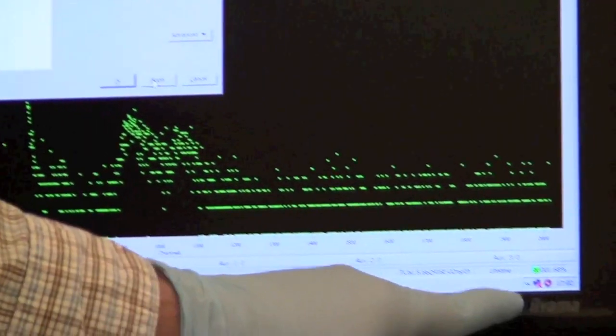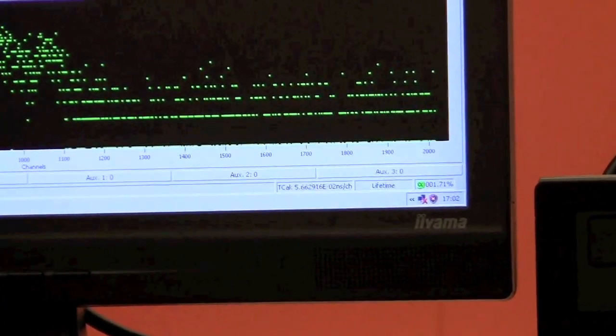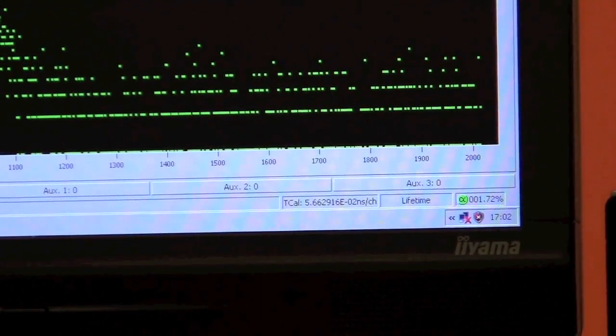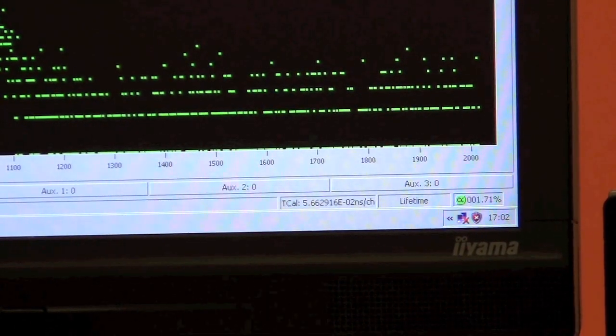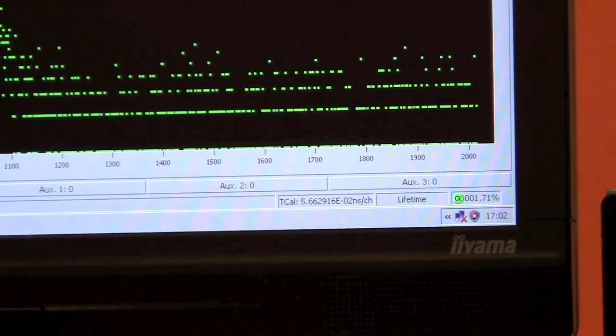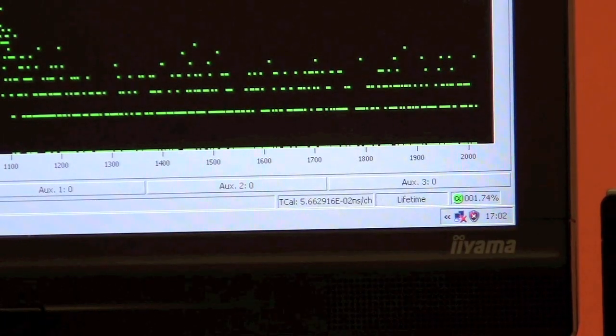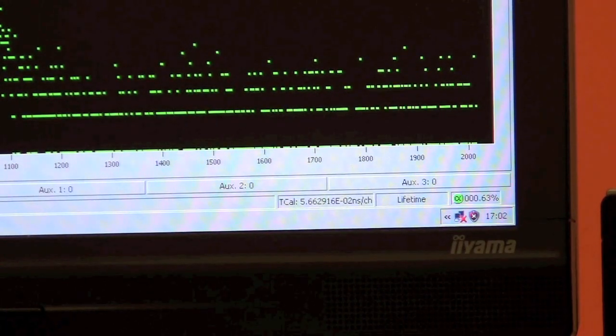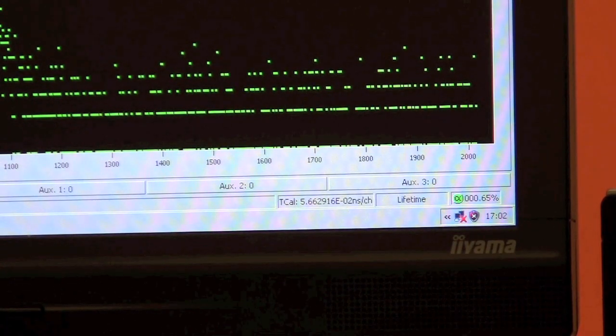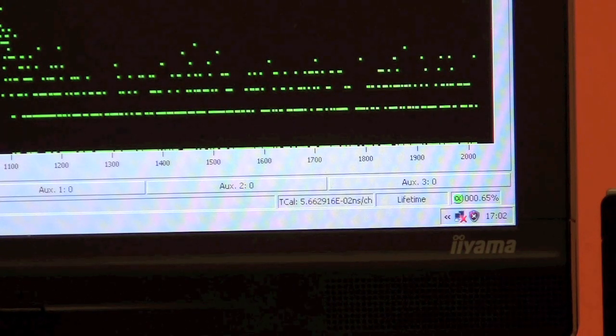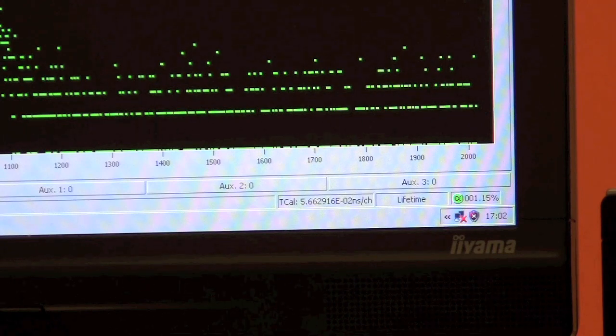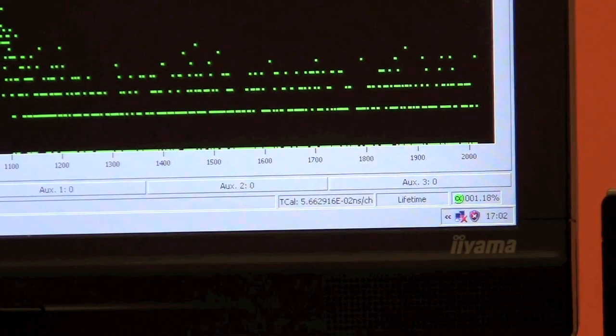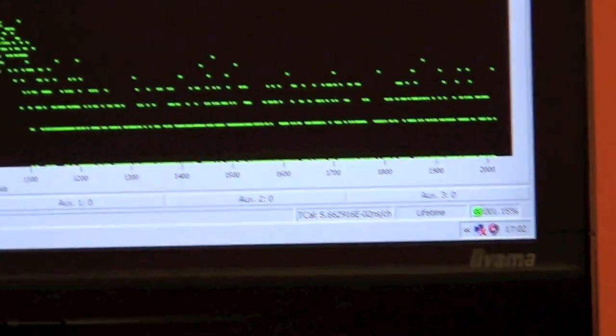Now we've dropped down to 1.68. Just to be safe, I want to go right around 1%, a nice happy medium. We've got 1.15% detection. Perfect.